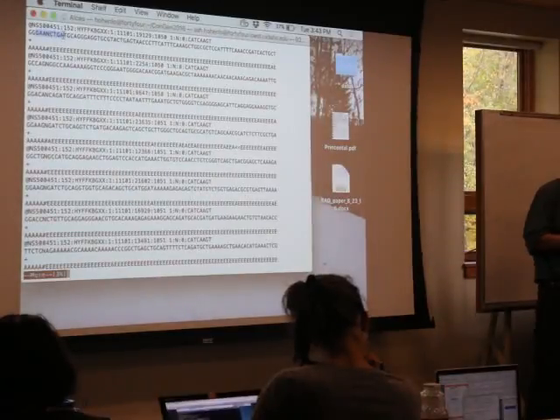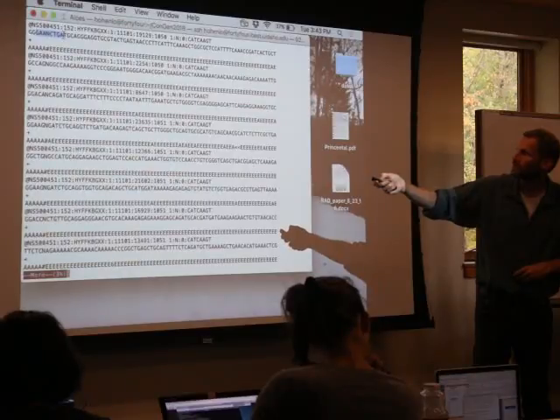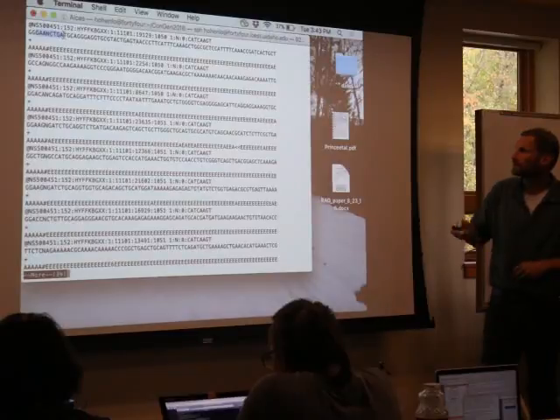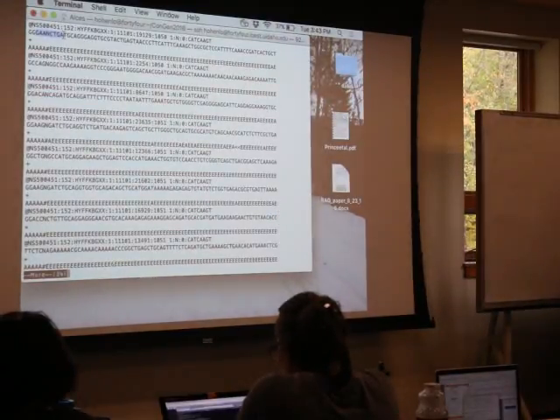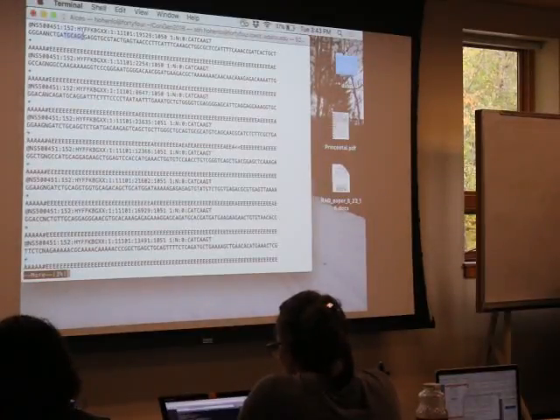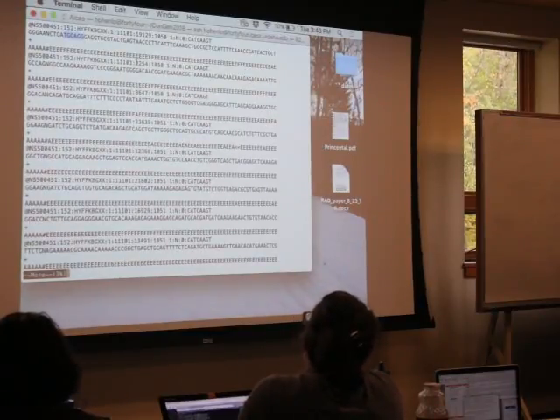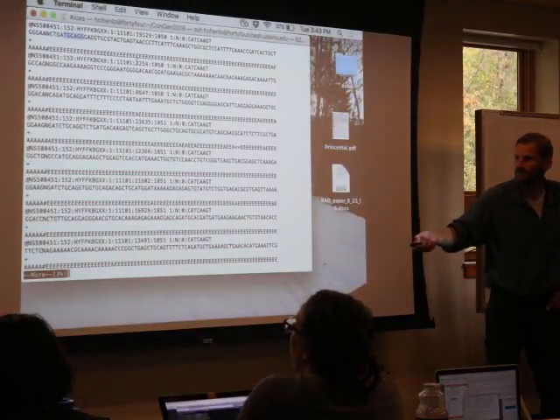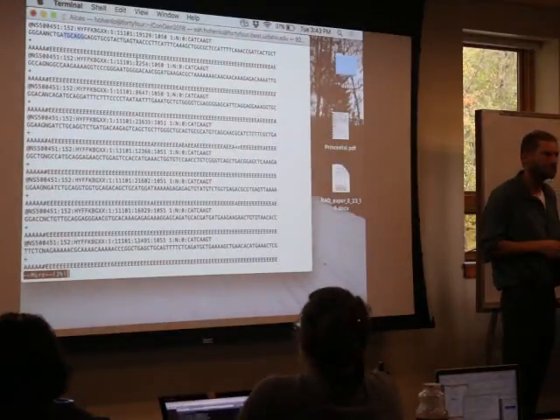But the way this protocol works, it always gives you these first two little nucleotides, which are usually GG. Those get trimmed off by that flip script that I put on there. Then you have the barcode. Then you have TGCAGG. So what enzyme did we use? SbfI classic. So that's the TGCAGG. And then the rest of that is just random genetic sequence.